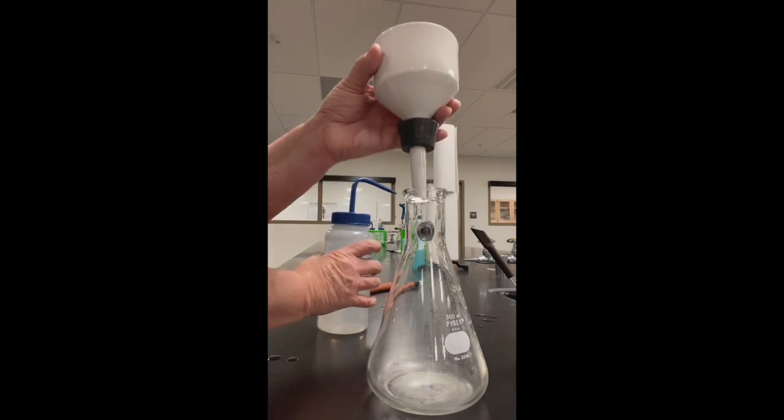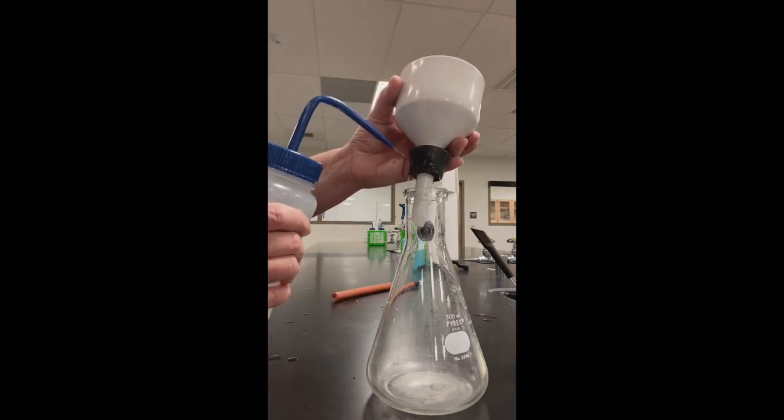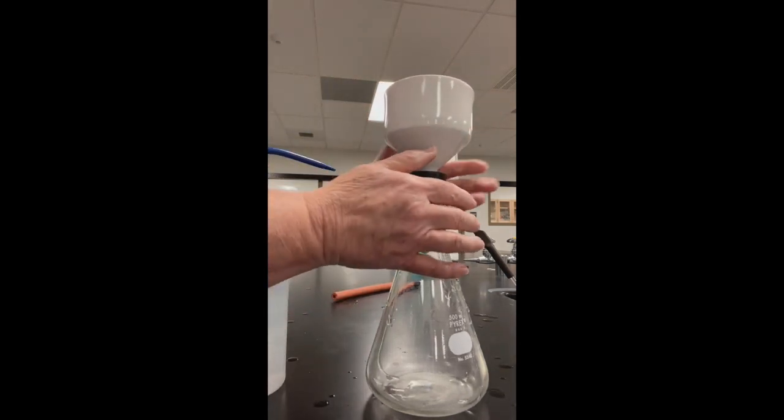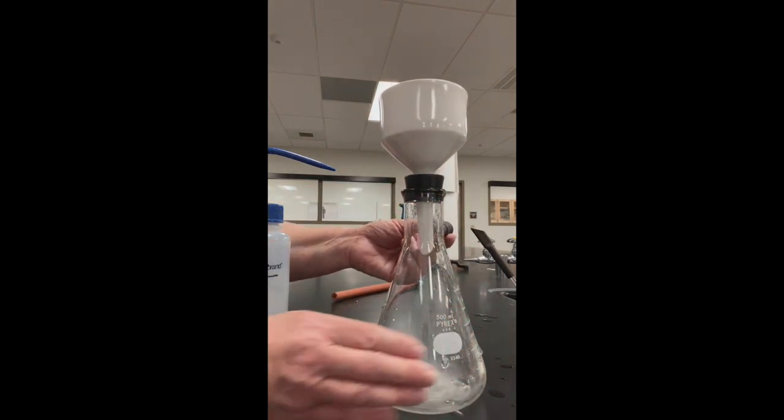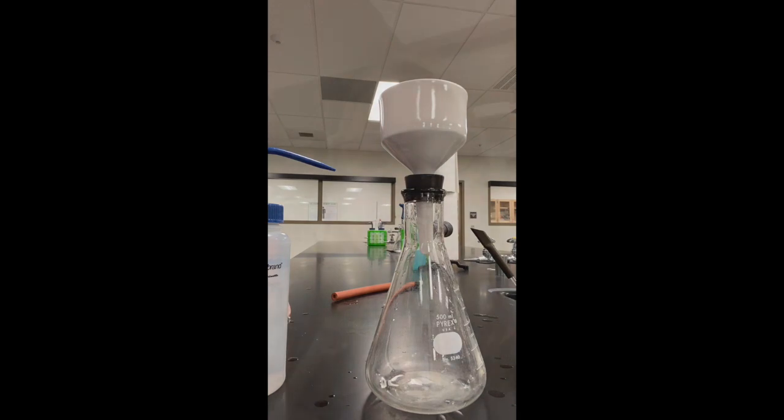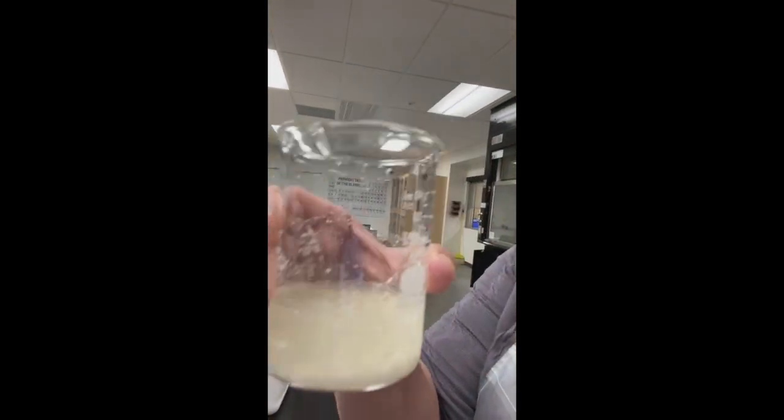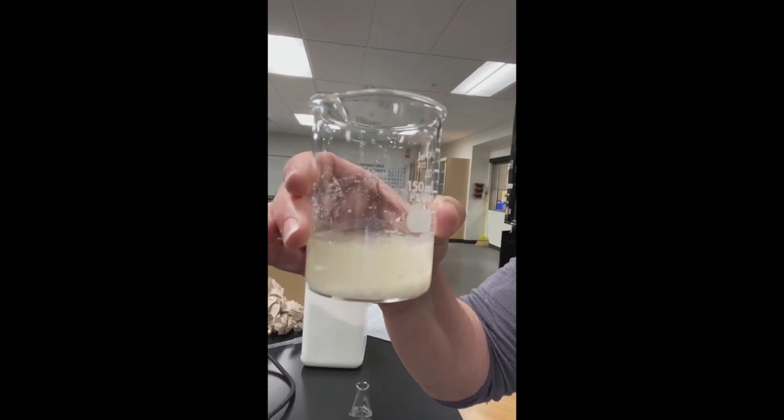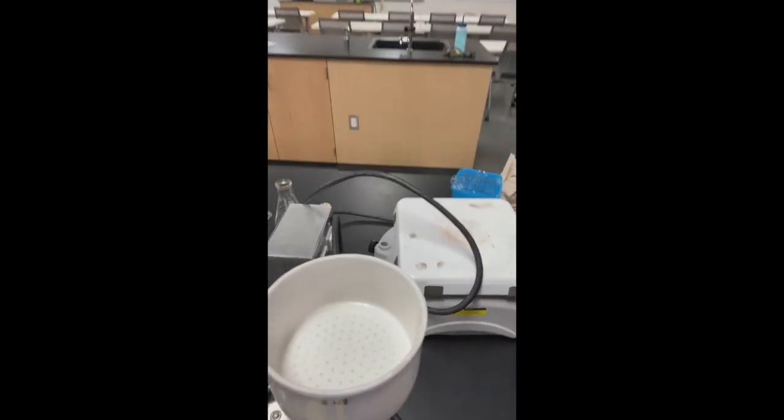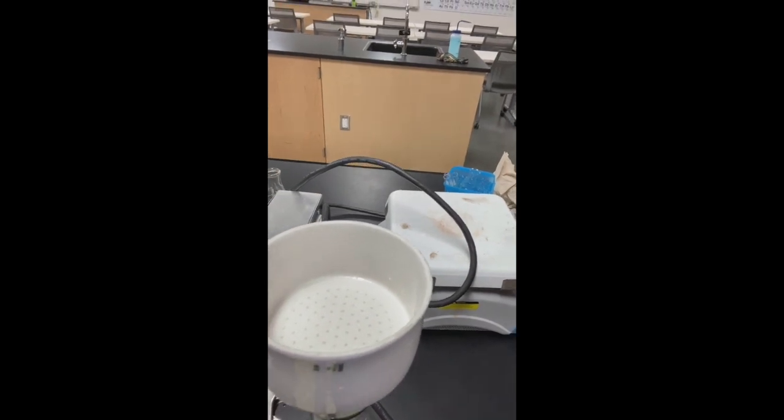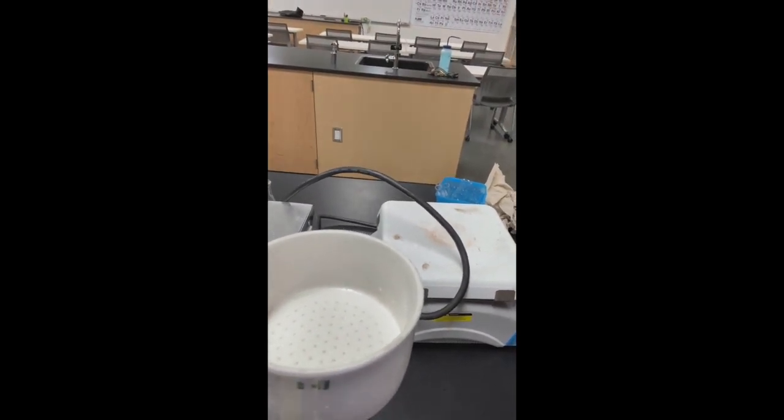When I'm putting a Buechner funnel into the filter flask, I need to get the rubber stopper wet a little bit. Push down on the rubber stopper and then attach it to have the vacuum go. So the vacuums aren't on so I'm going to have to use the aspirator. It's going to be kind of loud. I'm going to be taking these solids. I'm actually going to pour the liquid in first, as much as I can, into my filter flask here, into my Buechner funnel and collect the crude crystals.